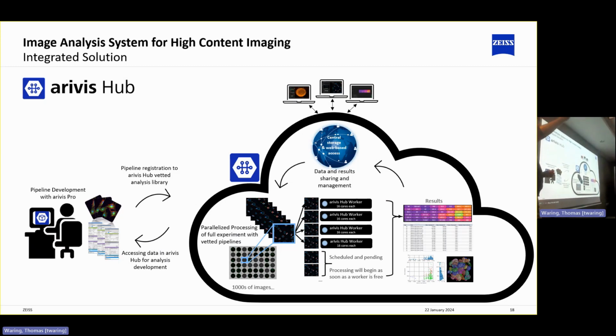You can find your data set, link them together, and then tell it to start processing away. You can also take advantage of the fact that the 3D engine, or GPU 3D engine, can be sitting on the cloud as well. So when you want to look at your data on your tablet, and it is a 1 terabyte 3D stack in time, you're not using the resources of your tablet to try and open that. You're using the resources of the 3D engine back in our server here.